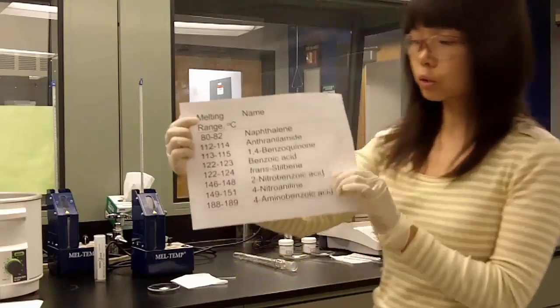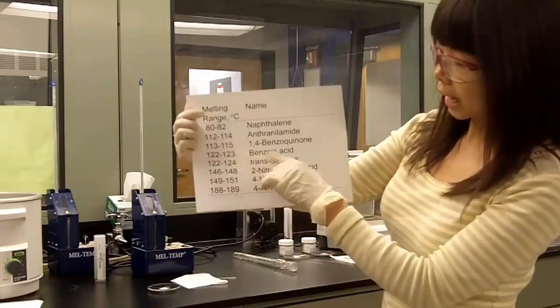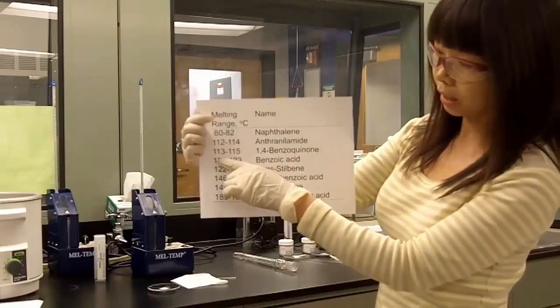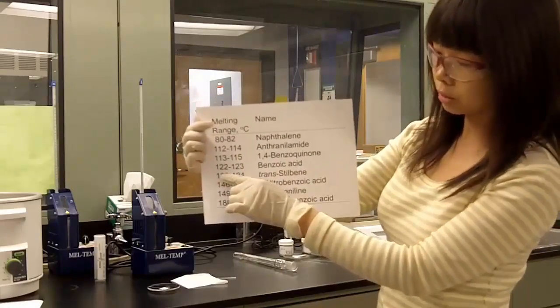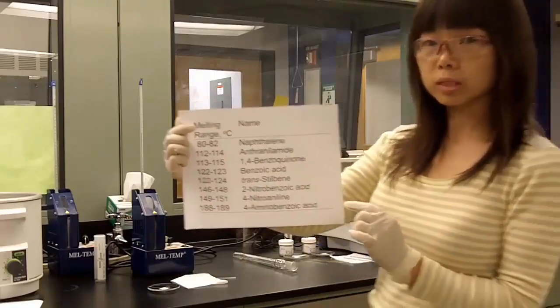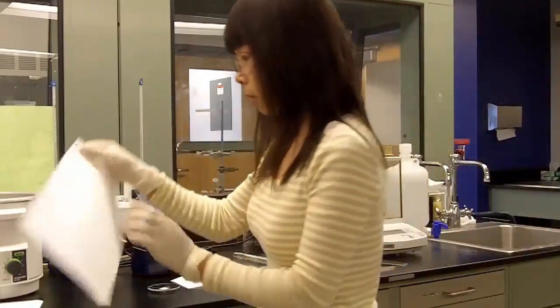So our sample could be benzoic acid, which has melting point at 122 to 123 degrees, or trans-stilbene, 122 to 124 degrees. So how do you know which one is your sample? At this point, you're going to take your unknown sample and then mix them with the two authentic samples.